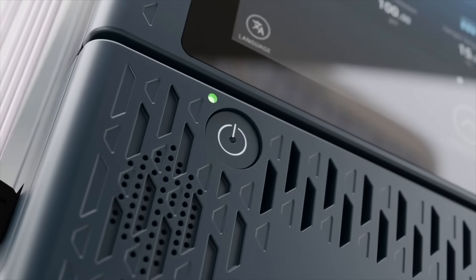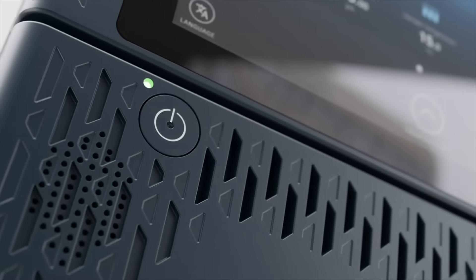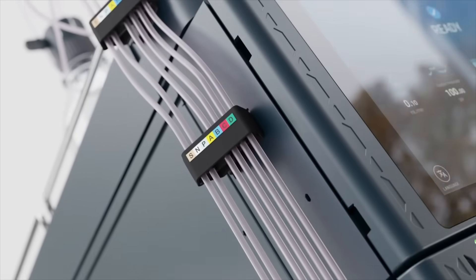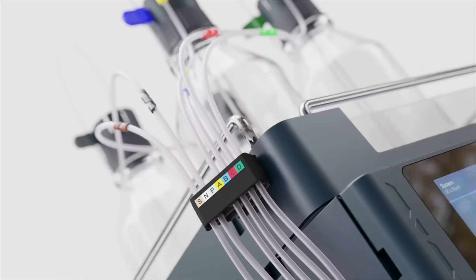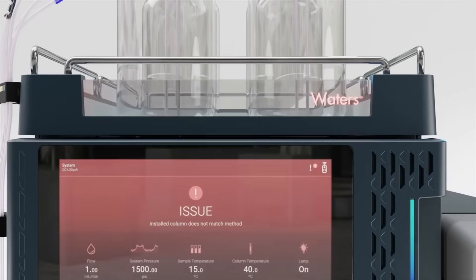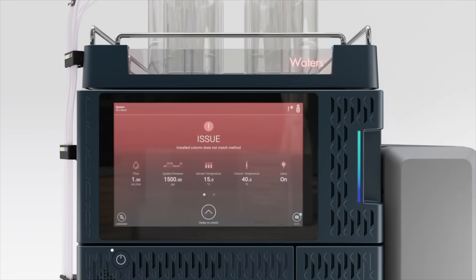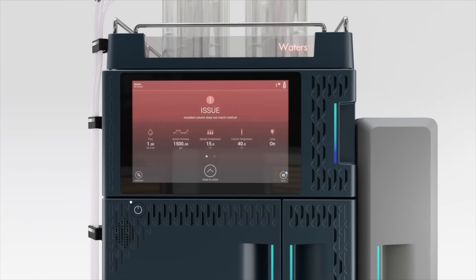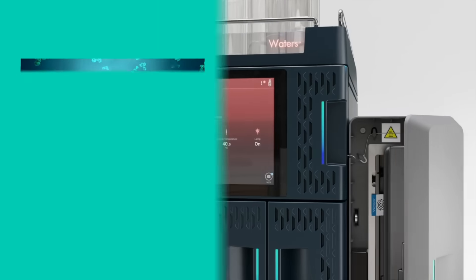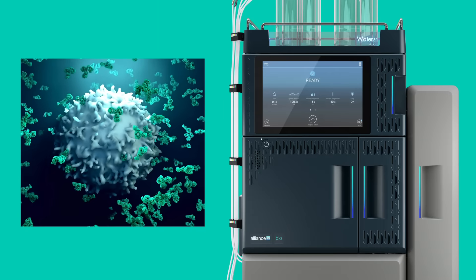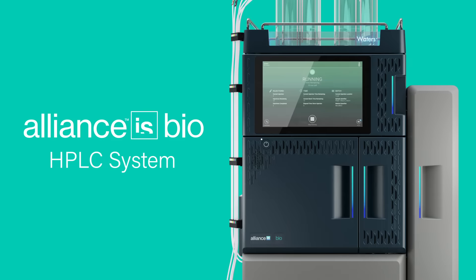Now the Alliance IS HPLC system is expanding to Biopharma QC labs, combining advanced bio-separations technology and built-in error reduction, bringing intuitive simplicity to your analysis. Meet your new lab ally for bio-separations, the Alliance IS-Bio HPLC system from Waters.